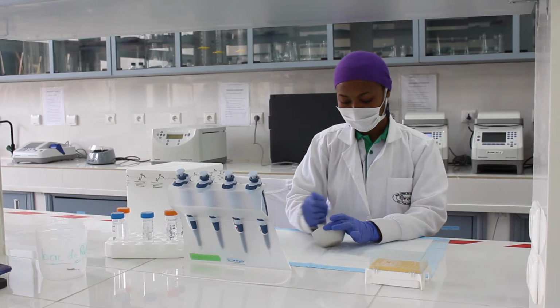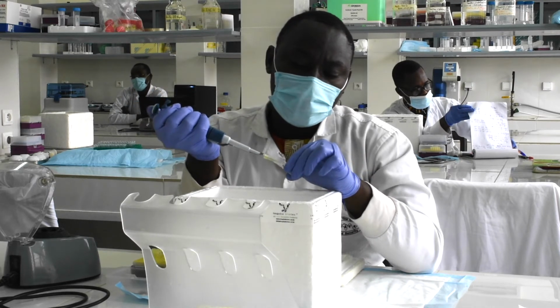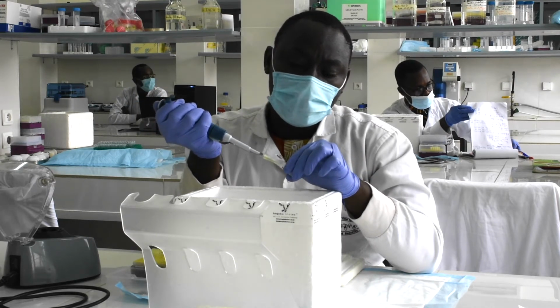Here, you are in the biology lab where we conduct a lot of research. All the samples collected from the survey are brought here in this laboratory. And here we can do DNA or RNA extractions. And then after we got the RNA or DNA, we start the detection using different methods.